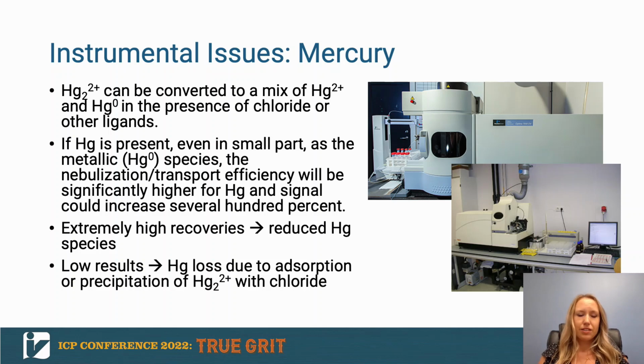On the other hand, if you're seeing low results, you could have issues with adsorption of the mercury to plastic containers or other plastic materials prior to analysis, or you could have had the dimer or metallic mercury present at some point in the solution, which was lost over time as the volatile metallic form.